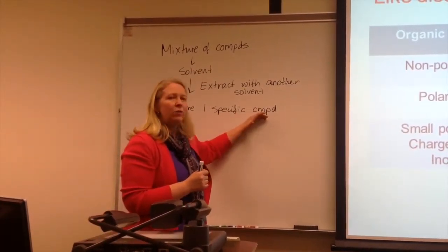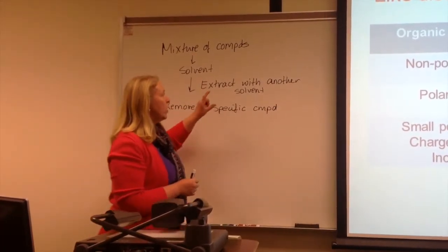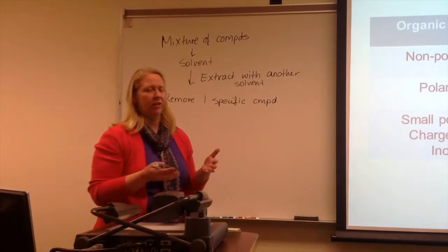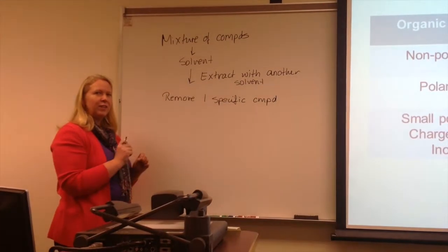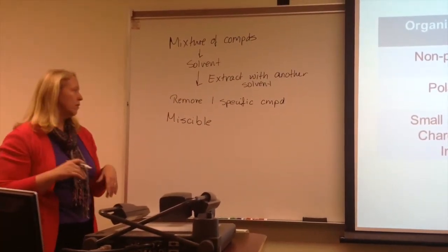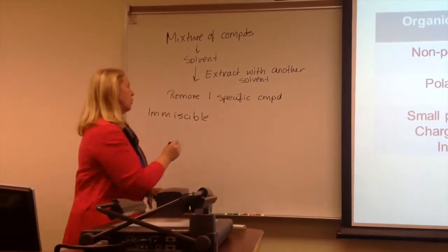As I was saying, for reaction workups, this is really important to purify your compounds or to extract something out that you don't want in your reaction mixture. Since we're trying to separate different compounds using different solvents, if the solvents would mix with each other, that wouldn't be helpful, right? And what do we call it when two liquids mix with each other? Anybody know? Miscible. Miscible, exactly. So this is not what we're going for. What we want are two solvents that don't dissolve in each other, and we would call that immiscible. It's basically just two M's in front. So this is what we're shooting for.